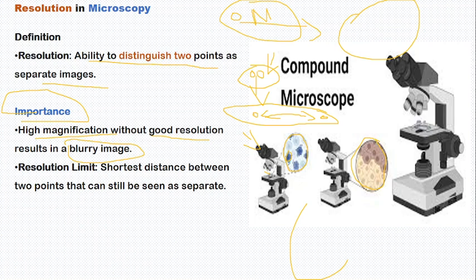So if you have never seen a microscope even once, suppose you put your eyes here in the ocular or eyepiece, this is the image which is going to come, okay? In this image, see, I'm seeing the points separately. This is point number 1 and this is point number 2. But imagine these are congested. You are unable to distinguish them, okay? But by using this microscopy, you are able to see the background. But these are vague. You cannot conclude based on those results. Those results are not good.